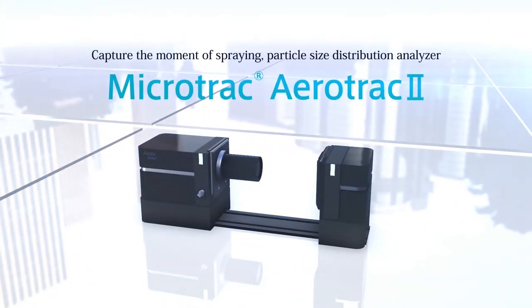Microtrack Bell, Aerotrack 2. Sprays and mists are all around us every day and used for many purposes.